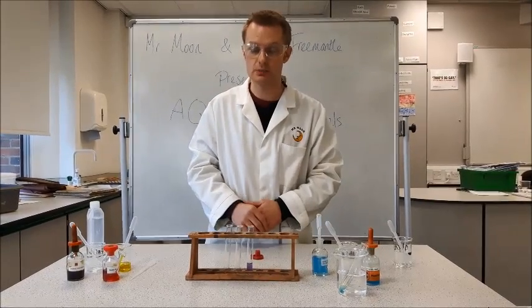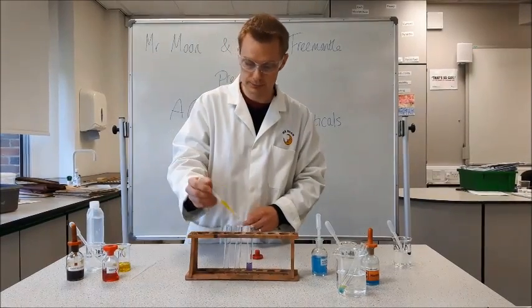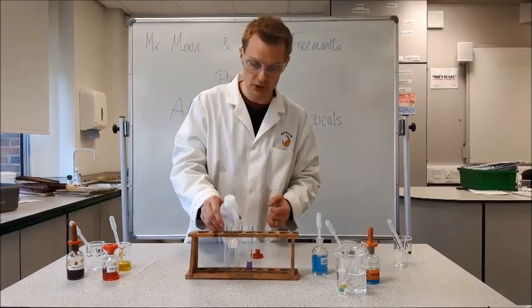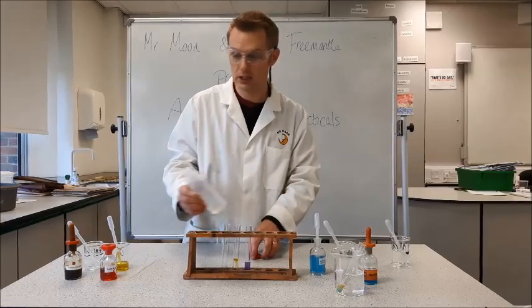If there is no protein it will stay blue. The next test we're going to do is for fat. So I'm going to add a sample of oil, and for this test I'm going to add some water as well, because we want to see some separation between our oil and our water.